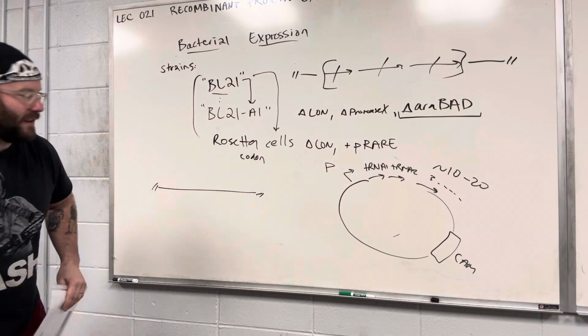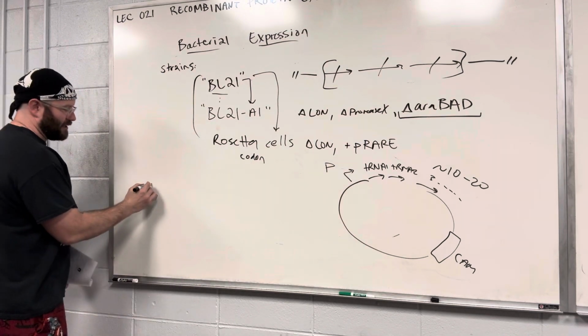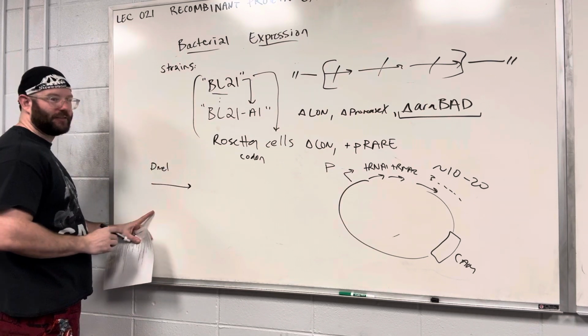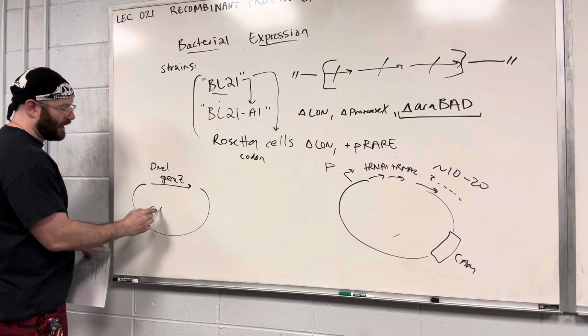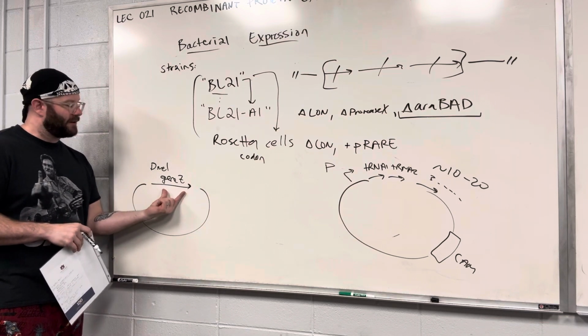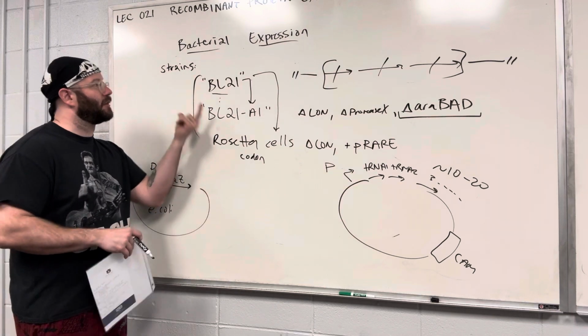Okay, so the reason that this becomes a problem is in recombinant protein expression, you're taking a gene from somewhere else. Let's say you're trying to express a Drosophila melanogaster gene Z, and you're putting that on a plasmid for E. coli. Gene Z is coded, in theory, in the codon preference of Drosophila, which probably does not match E. coli.